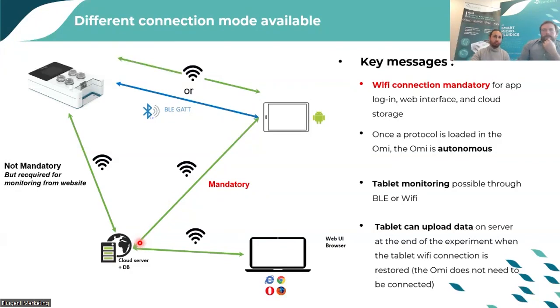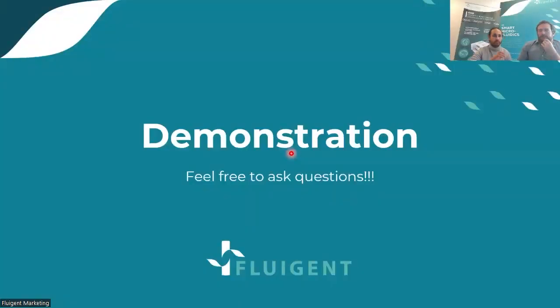So now I'm done with those technical details. I think we can go on with the demonstration. Yes, we will go on with the demonstration now. The idea is that we present you OMI with a zoom on OMI and all the components of OMI. If you already have some questions, we can start answering at the same time. The idea is that we have interactivity at that time, so if you have questions, feel free to ask them now.